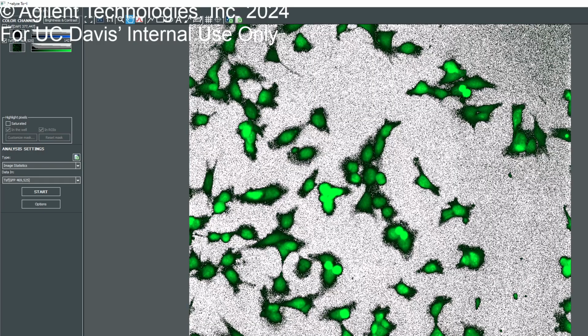So now these results are going to change based off what we see in the image. So now the mean intensity has improved because it's not using this dead space for the counting. And also you can visualize the confluence value, which is 37% right here. The confluence is right there. So this is a very simplified way of visualizing image level results. But this is typically not something you would use for object level results or microglia morphology analyses. We are probably not going to use this at all. Just something for you guys to know.